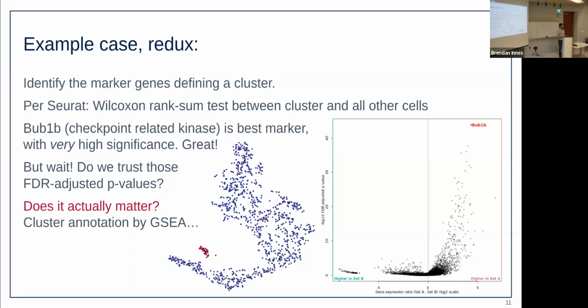And it might be, again, how we're calculating effect size, or one thing's 0, or these tests are sensitive to the expression levels being high or low. But yeah, so maybe in cases where the p-values seem to be very disconnected from the effect size, then the rank order isn't maintained. But in cases where the effect size and the p-values line up nicely, I imagine that the rank order of p-values is true, even if the actual p-values are inflated. Thank you. Delaram, did you have more questions?